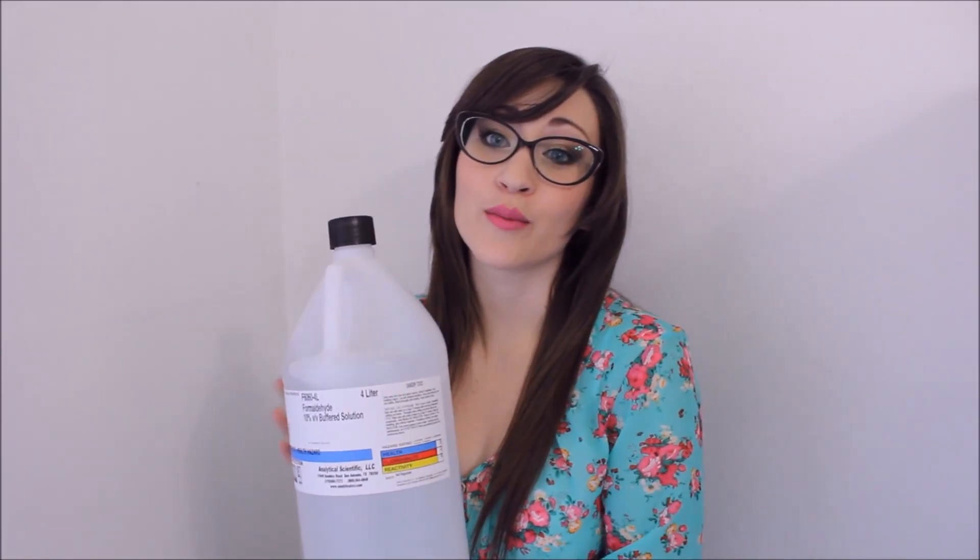This is one gallon of formalin. This is what you'll use to fix your specimens — to preserve them so they don't start decaying during clearing and staining. It runs about $30 to $60 depending on where you get it. You're also going to need glacial acetic acid, 99% — I bought a gallon off the internet in four-liter bottles. 95% ethanol or ethyl alcohol is another chemical you'll want to use.